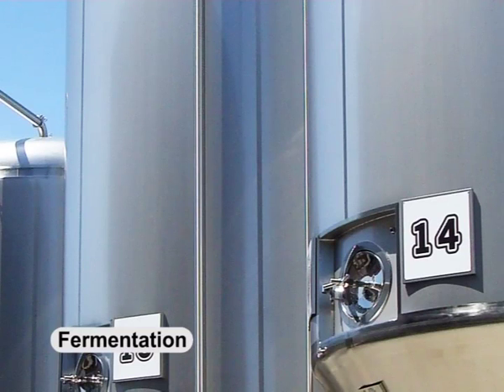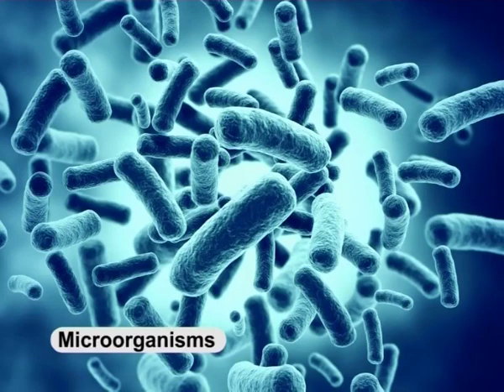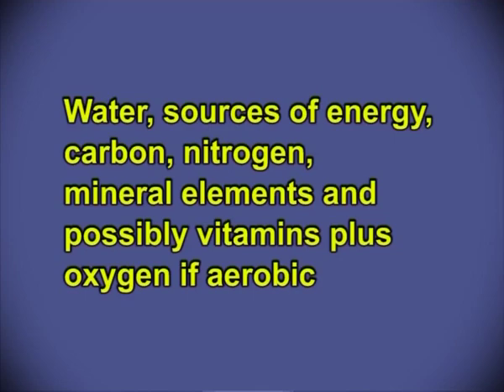All fermentation media used for the growth and development of microorganisms generally require water, sources of energy, carbon, nitrogen, mineral elements and possibly vitamins, plus oxygen if aerobic. On a small scale, it is relatively simple to devise a medium containing pure compounds, but the resulting medium, although supporting satisfactory growth, may be unsuitable for use in a large scale process.